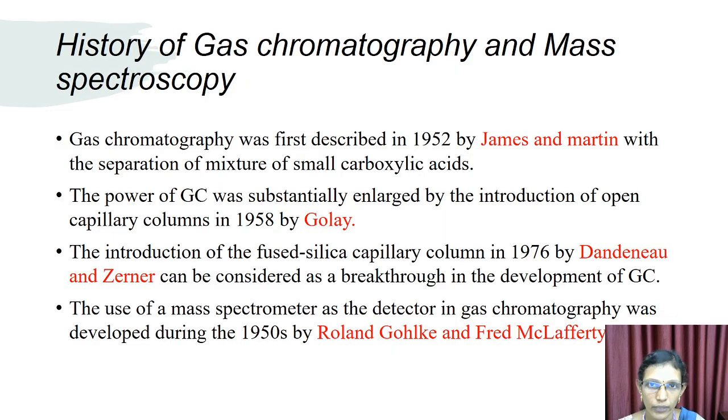What is the history of gas chromatography and GCMS? In 1952, James and Martin separated a mixture of small carboxylic acids. In 1958, Golay introduced open capillary columns.